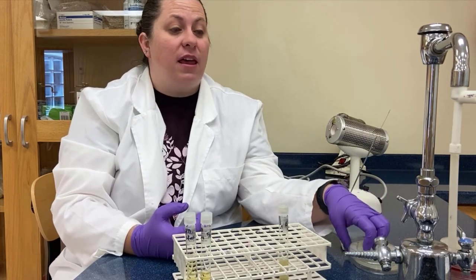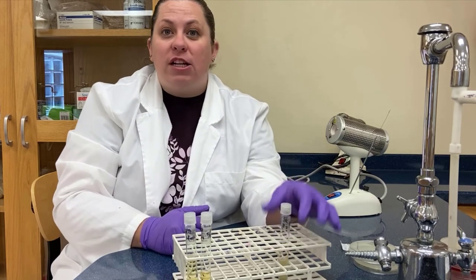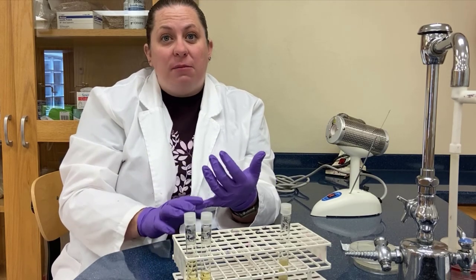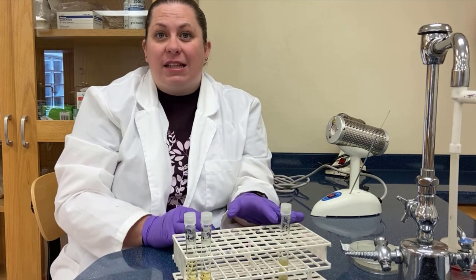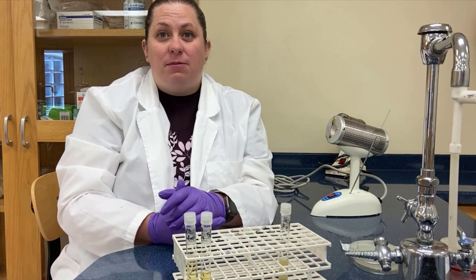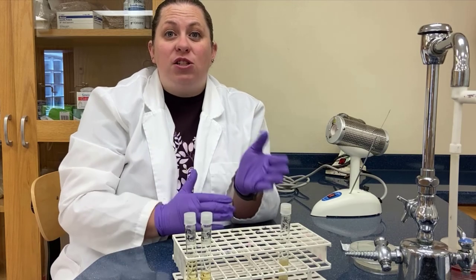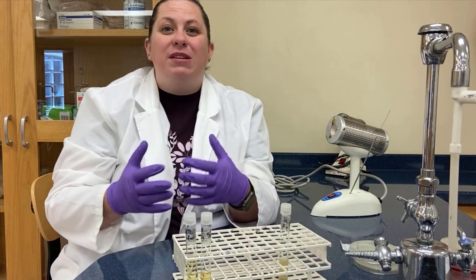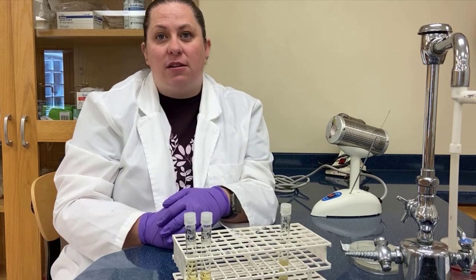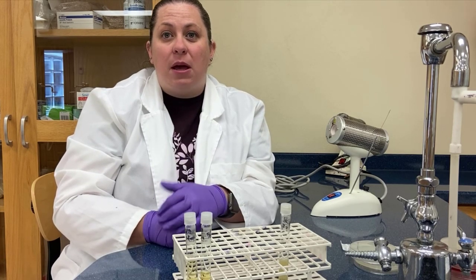That gives us an idea of the whole concept of aseptic transfer. There are a couple of other things with aseptic transfer when looking at plates and different types of tubes — liquid versions or those with agar inside. We'll talk about those techniques when we get to the labs that specifically address spread plates, streak plates, and slants. The whole idea of an aseptic transfer is to make sure you're only transferring what you want — in these cases bacteria to our plates — and that it wasn't contaminated with something else. That's why these aseptic techniques are so important to practice before starting actual lab work.